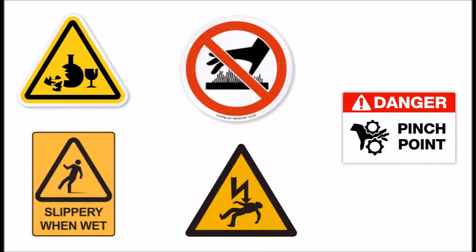The next hazard is an electrocution hazard. Be careful when turning on and off switches and when plugging in and unplugging equipment to make sure that your hands are dry and you are not standing in a puddle. Also, do not touch prongs when plugging in and unplugging equipment. Our next hazard is the pinch point hazard. In the case of a pinch, treat injuries with a first aid kit present in the lab.